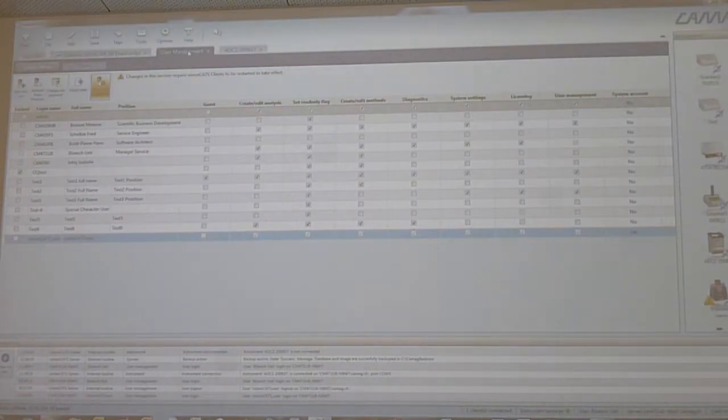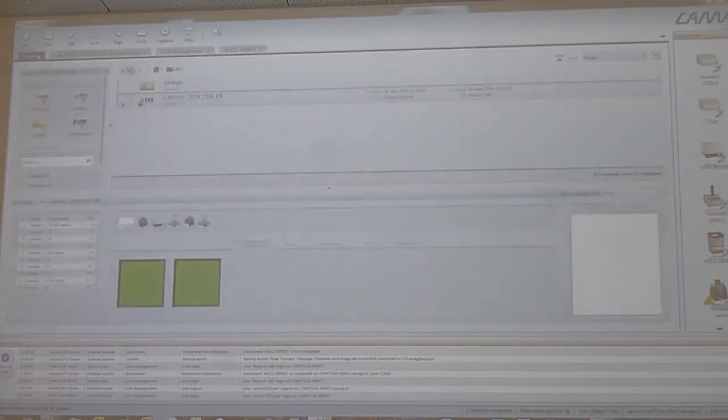If I untick this set read only flag, I have right mouse click and I see the point, but it is grayed out. And also maybe to this lock, there are three kinds of locks. So this gray lock means this is a locked analysis because somebody locked it.